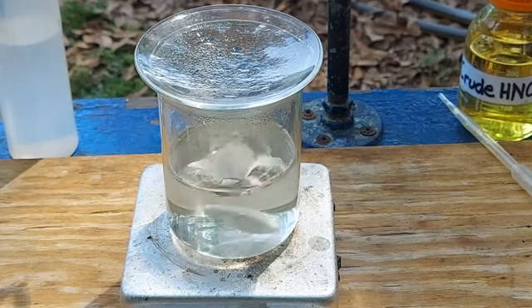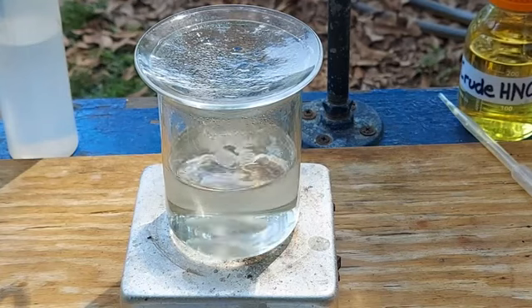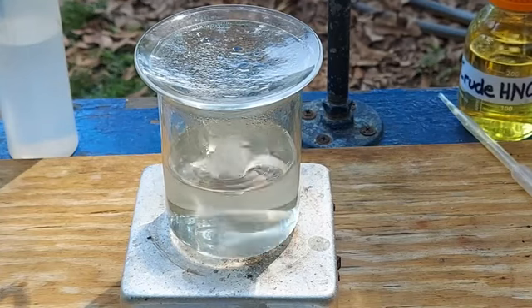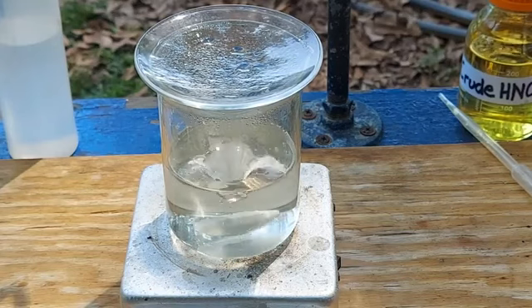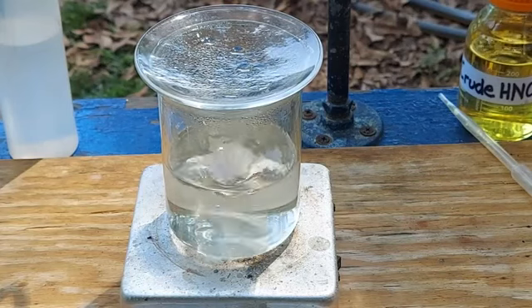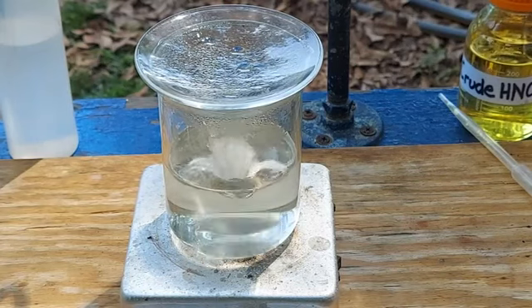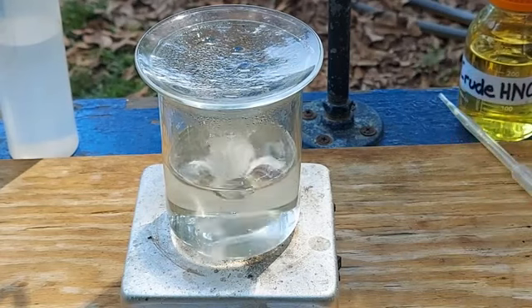But with hydrochloric acid, no matter how much acid you add, that isn't going away. That is there to stay until you bubble chlorine through it. But with nitric acid, since it's an oxidizing acid, it doesn't take very much for it to begin to oxidize all the mercurous nitrate to mercuric nitrate, and the problem goes away.